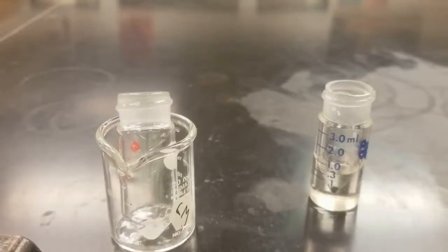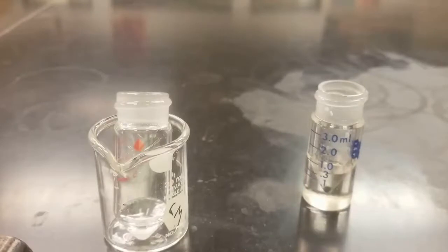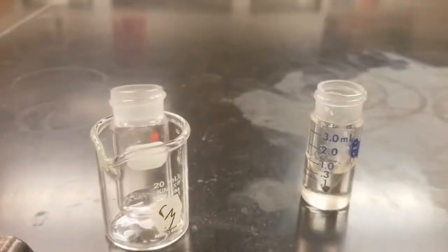Add another 600 microliters of methylene chloride, just to rinse off our sodium sulfate. And then go ahead, suck it up and transfer it over.